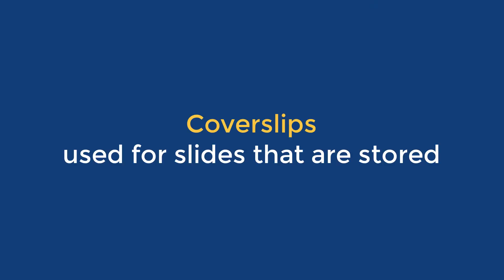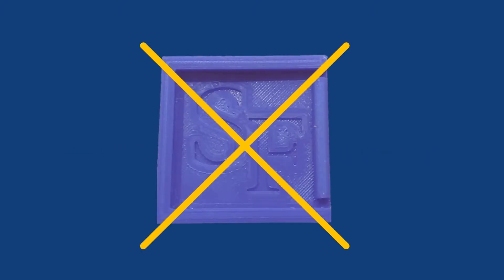Note that we normally do not use cover slips to prepare a bacterial smear unless we want to save the slide for later use. In our class you will therefore not use cover slips.